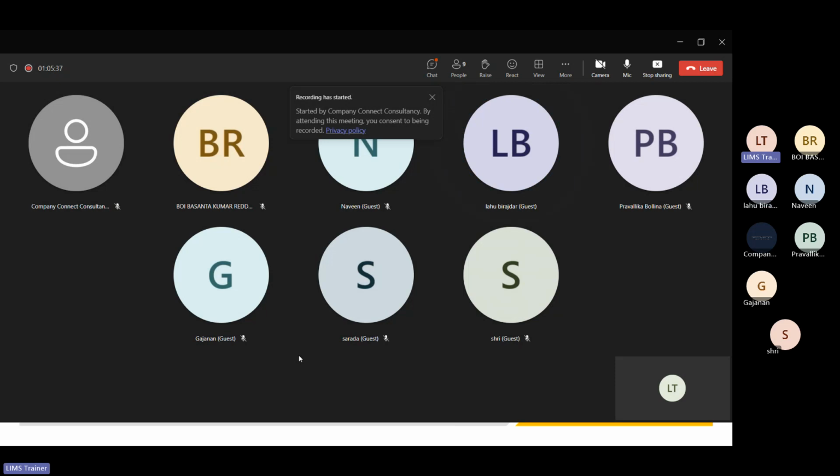Okay, there will be screenshots of the software. Why? Because using that particular software for this purpose, for demo purposes or our class purposes, is not possible. So that's why we have designed it like this. But I give you the assurance that you will find it easy when I explain how you are working with the stability module. There you will understand that it's very easy.